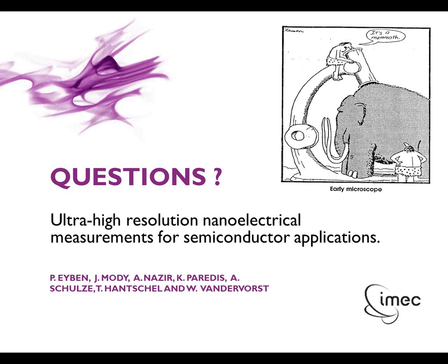Thanks. Maybe related to that, any hints on particular probes to use when investigating these samples? Personally, I've used a variety of probes. I like to use the platinum silicide probes. And depending on whether we use contact or the PeakForce mode, we need to select the proper spring constant. In contact, probably a little bit softer than in PeakForce Tapping.